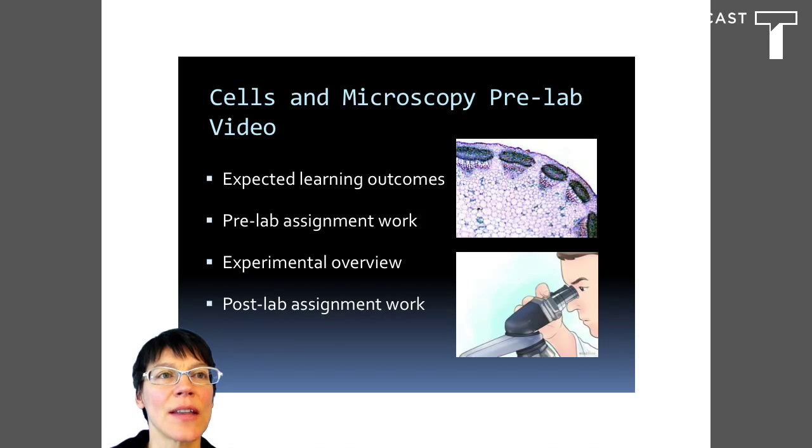I'm going to talk to you about the cell and microscopy pre-lab video. I'll cover the expected learning outcomes, the pre-lab assignment work, and give you an experimental overview, and talk about the post-lab assignment work.